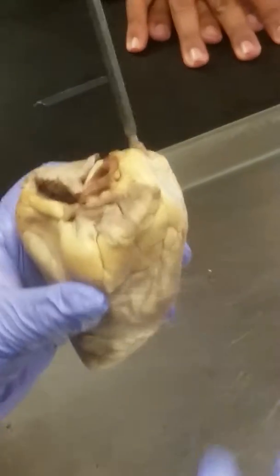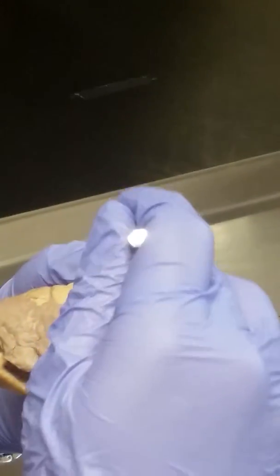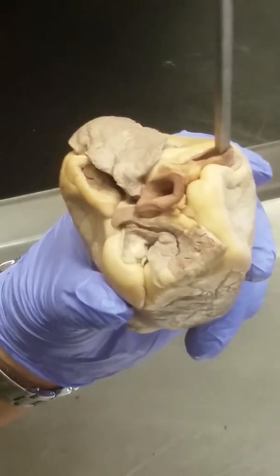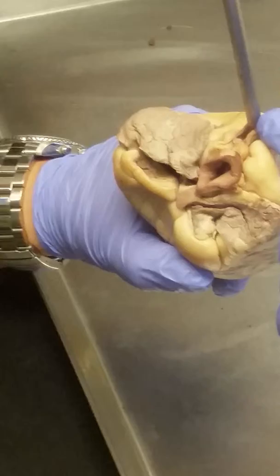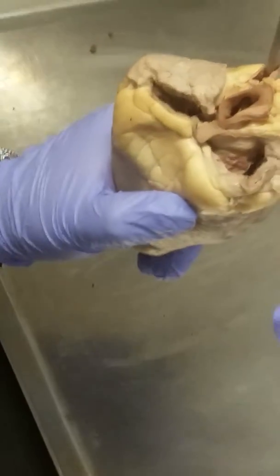Okay. Now, one of the things that you guys should be able to do is tell me what vessel the blood is going into. So, what vessel do you think this one is? Who says superior vena cava? Who says no? You're right, it's not. This is the pulmonary trunk. Remember, pulmonary trunk is first. Then the aorta. Then the superior vena cava. Remember, it would have been cut on these guys.